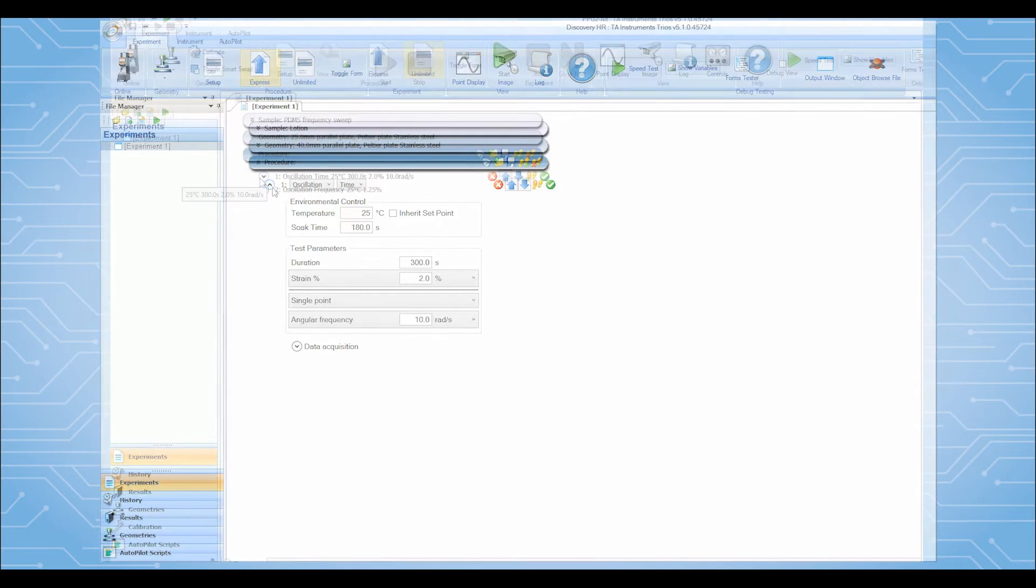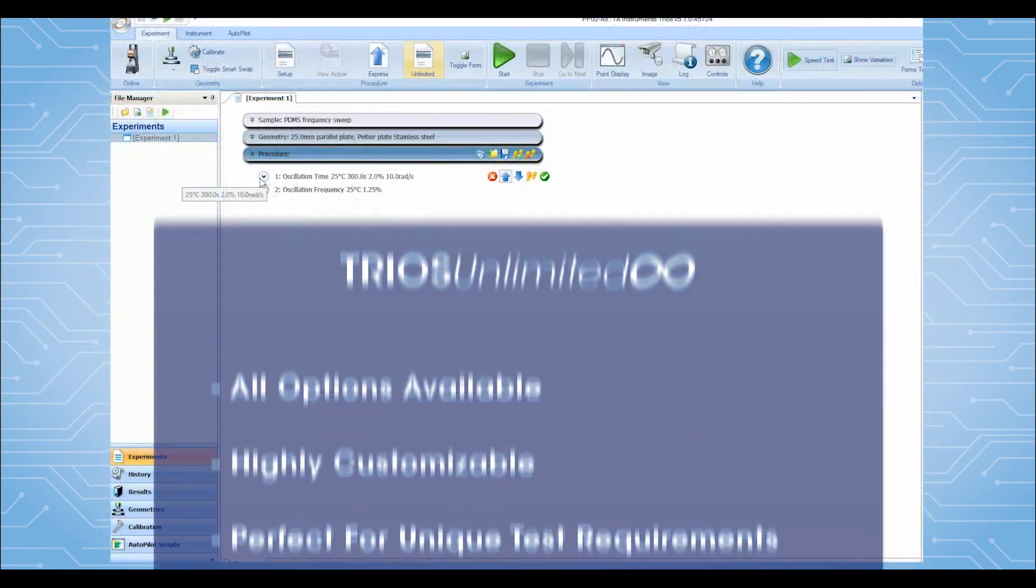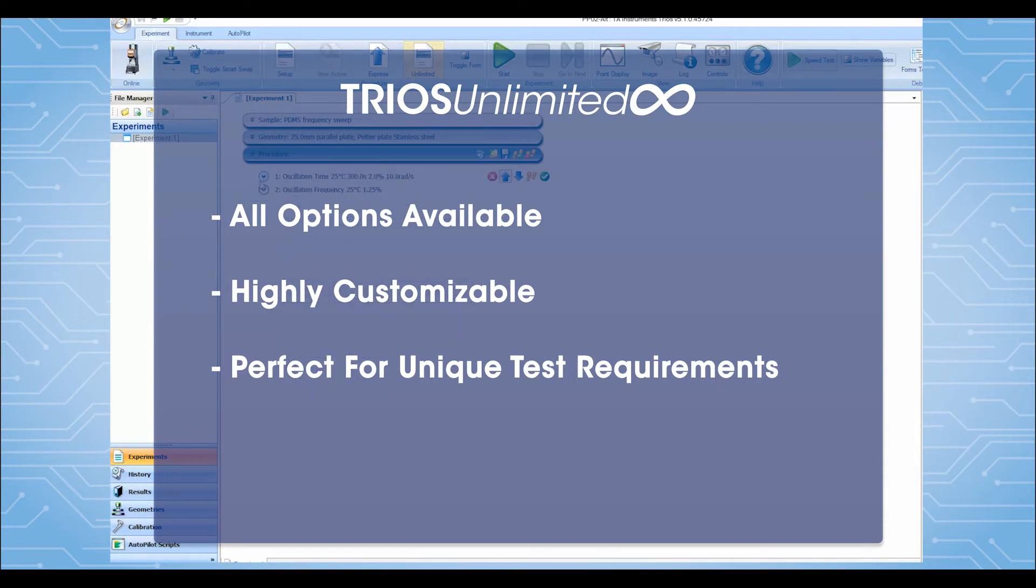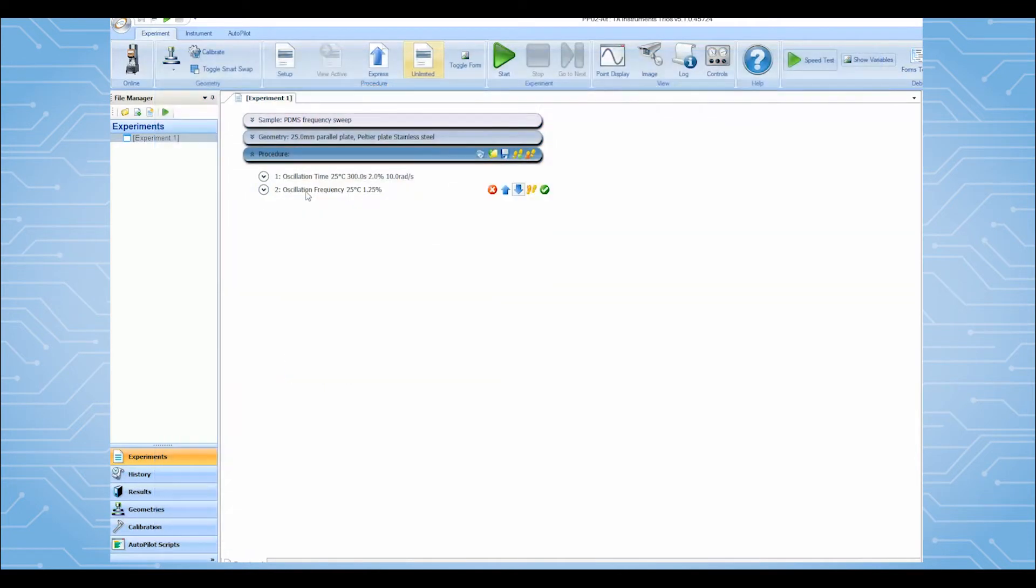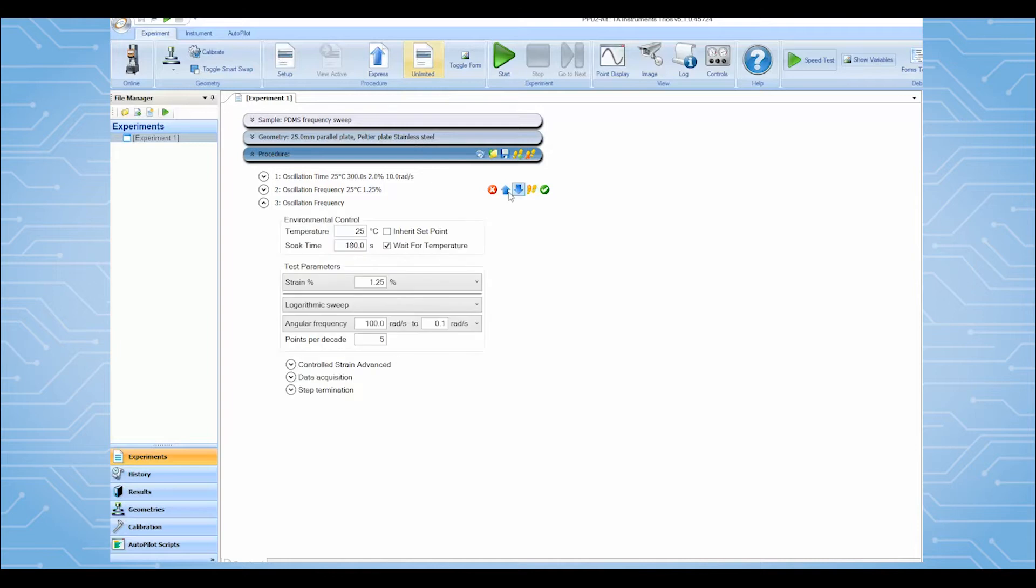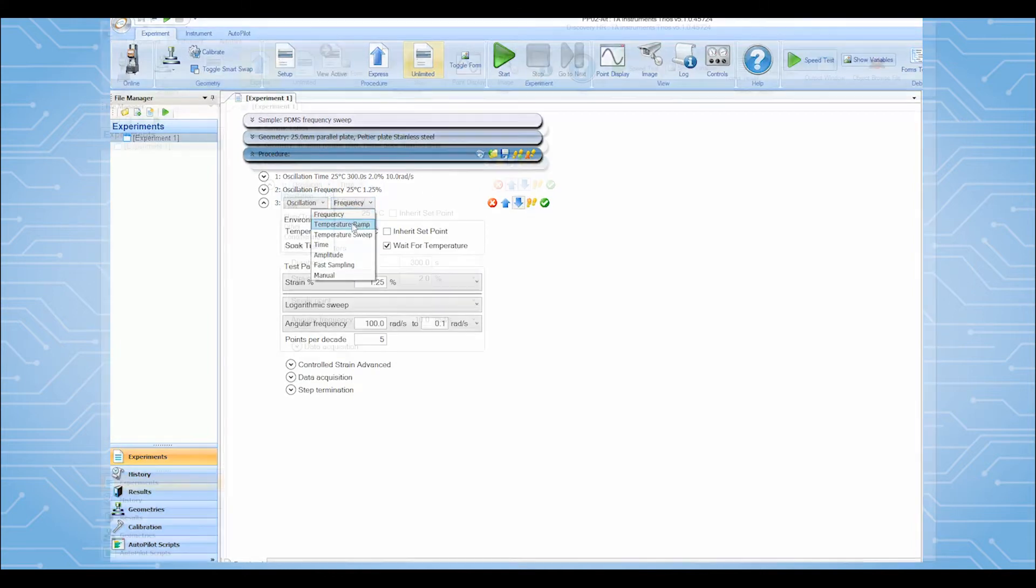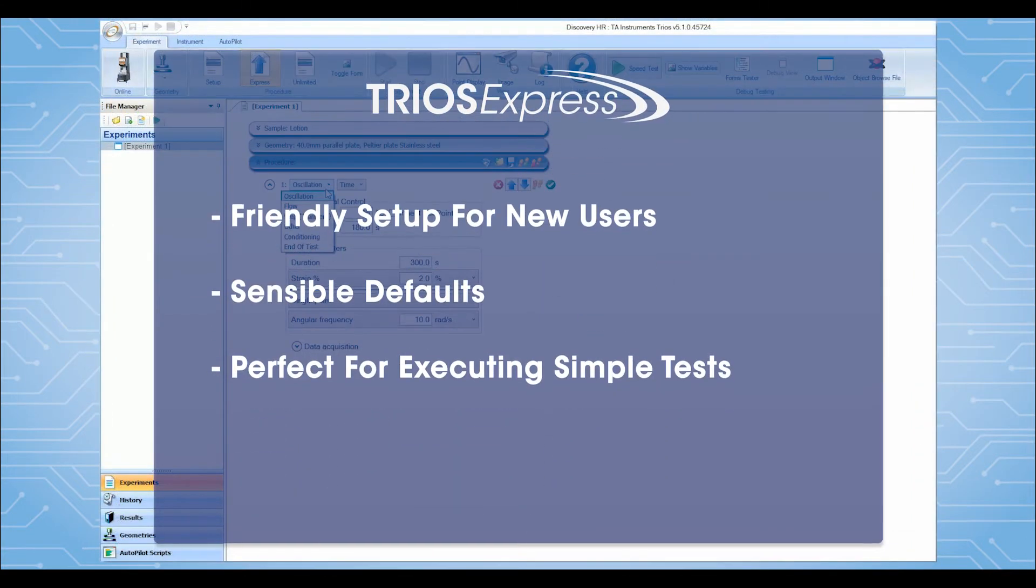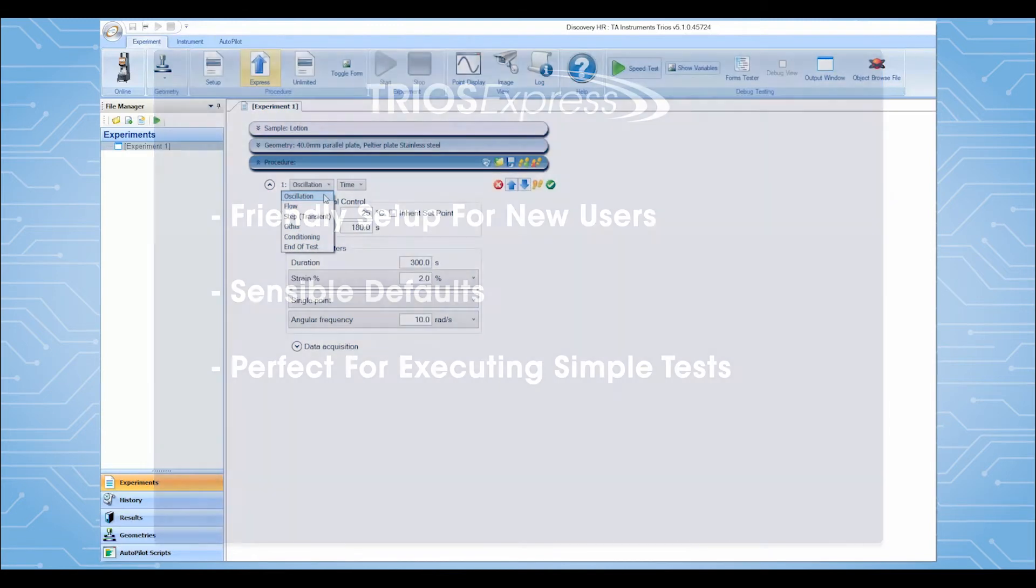The Unlimited mode provides users with complete access to create test protocols using any and all control modes, while the Express mode is designed specifically for new users and those with simple, well-defined experimental requirements.